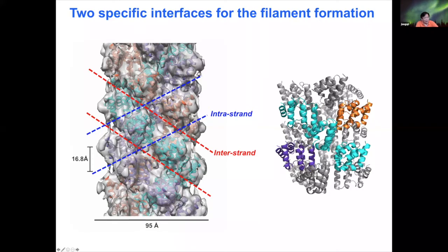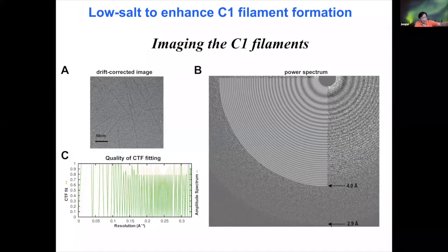And we also had electron tomographic data apparently agreeing with the C3 symmetry. For the C1 symmetry, we were able to use the Titan Krios at Genentech and obtain high resolution data, where the data quality is probably as good as 2.9 angstrom.